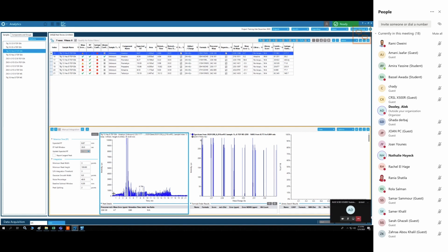It's a little difficult. Yes. Can we check the pressure if it changed during the run, or maybe if the column wasn't equilibrated long enough? I'm also leaning towards your second point myself, that we don't have enough equilibration time in the column, and so the column was not prepared to accept the next sample.